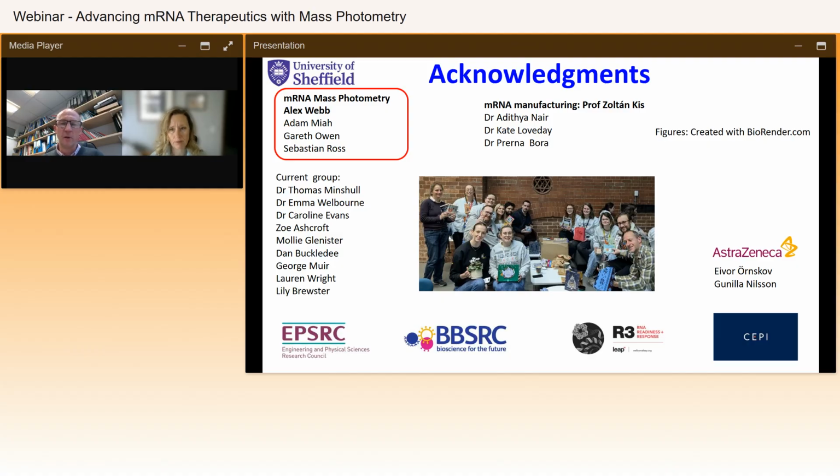So, in some respects, it's kind of matrix independent. You can do the analysis in 1x PBS. We've actually even done the analysis in ion pair reverse phase buffer by just taking the material straight from our chromatography. We don't even have to dilute in PBS, and we'll still get good data. Or you can add magnesium to the analysis, or even add detergents, moving to more denaturing conditions if you want by doing the analysis in urea as well. So a broad range of buffers are compatible.